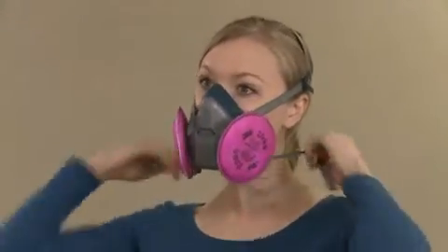Rinsing your mouth with water may be helpful. Next, put on your respirator following all instructions for proper fitting, including a user seal check, as taught during your training session.